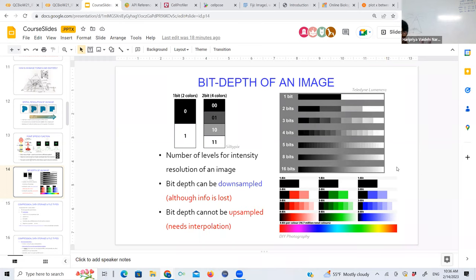Some things might be really crappy, right? Whether I get 5 photons or I get 20 photons, I'm just going to generate like 1 microamp of current. Some other things will be like, if I get 5 photons, I'll make 5 microamps. If I get 20 photons, I will make 20 microamps. That all depends upon the semiconductor material. So here's where quality of the camera and the detector does come into play, that it gives you the resolution.